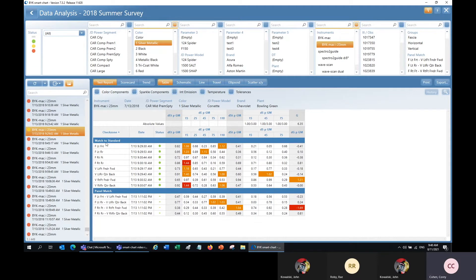The selections we have for the table include the test report. The test report is where you can view one test series only. You can see here we have all of the check zones for this test series as well as the panel match. We can see the DE values for each, as well as the delta sparkle values and the graininess values.